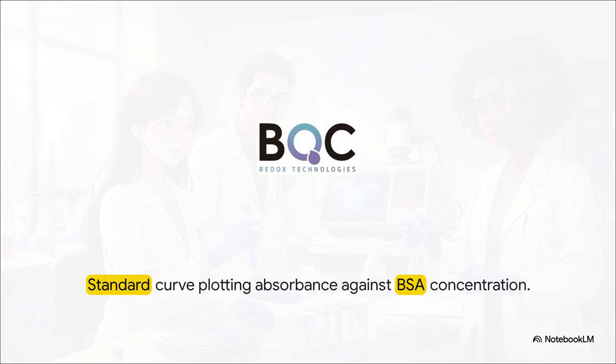So when we measure the absorbance of our unknown sample, we simply find that specific number on the y-axis, trace it horizontally over to our line, and then drop straight down to the x-axis. Boom! There's your exact protein concentration.